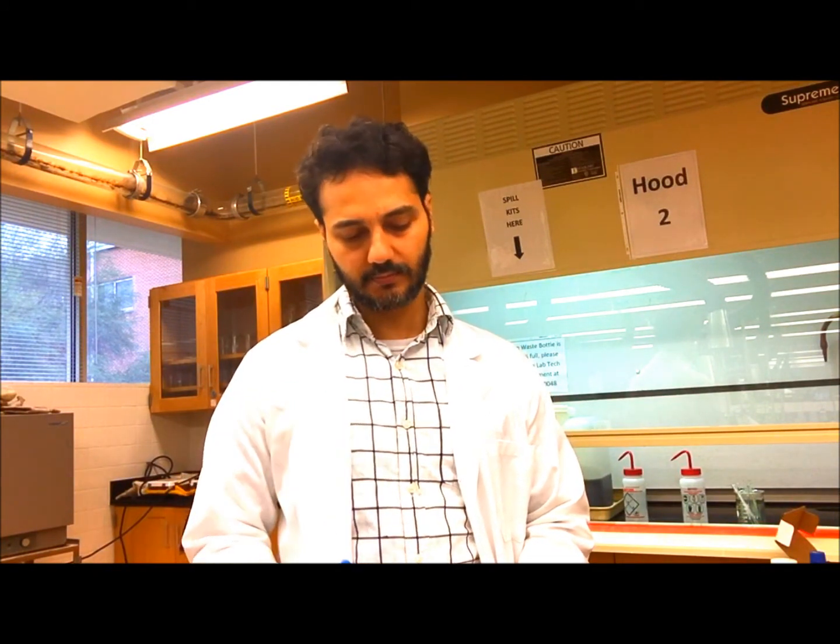So we will periodically check during our steam distillation. If we don't collect any more water insoluble organic compound, that's when we will stop. And so we will have in our collection flask a mixture that we will then put back in the separatory funnel, where we will have two layers. We will discard the aqueous layer and we will keep the organic layer.